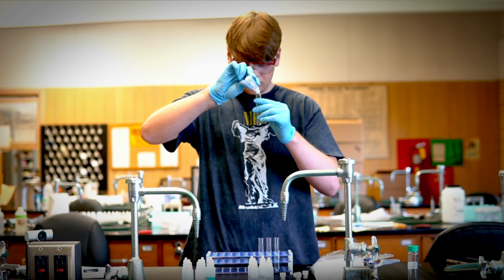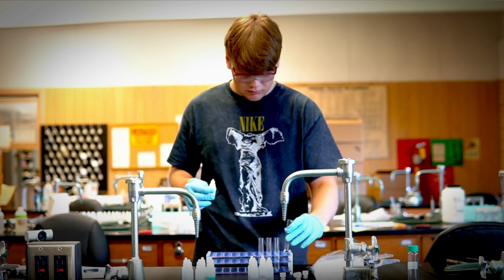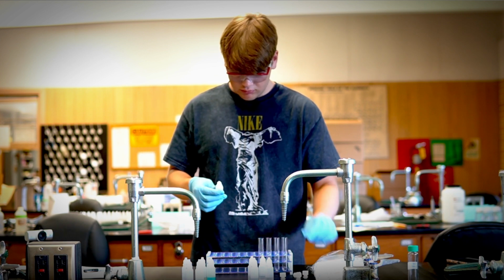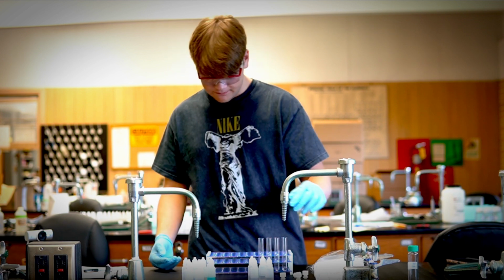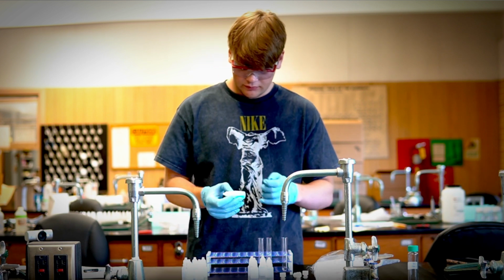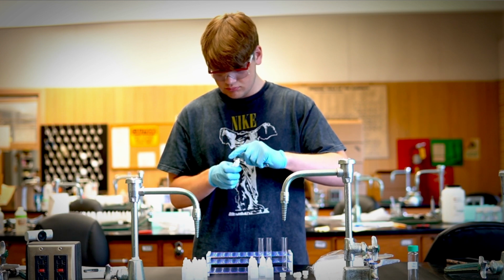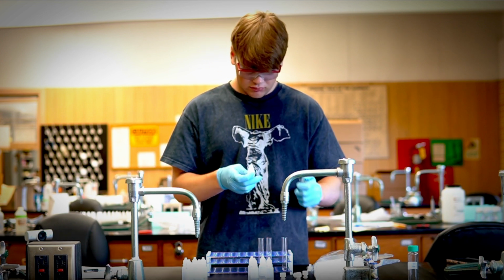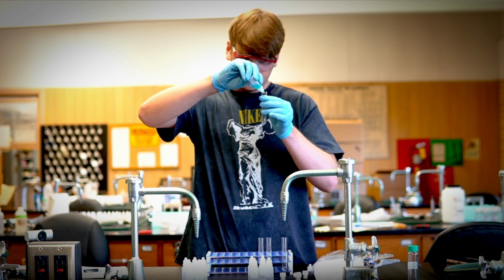So you're going to drop your solution into the test tube as shown in the video, and then you are going to record your observations. Right, so whenever you see a precipitate, whenever you see a change of color, whenever you see bubbles, you are going to record all your observations. And after you record your observations, you're gonna go to the next one, and then you're gonna keep going until you finish all of your cations.